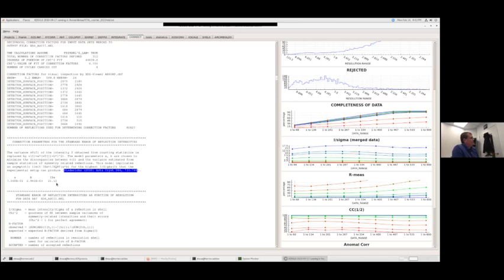If you get down below a 10, it's not a great data set. You still might be able to get useful information from it, but what you'd want to do is make sure you collect a lot of redundancy in your data. So you would want to collect a larger data wedge as that drops down. So just be aware of that. It's a good thing to check out.